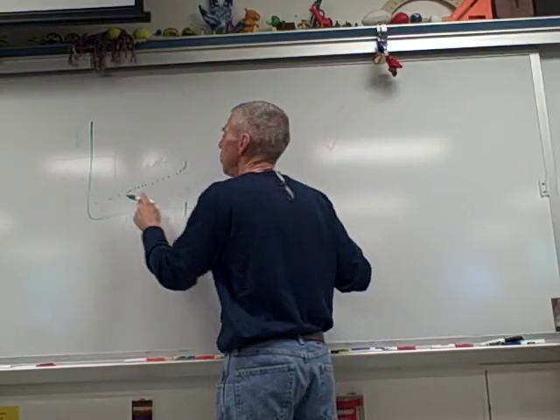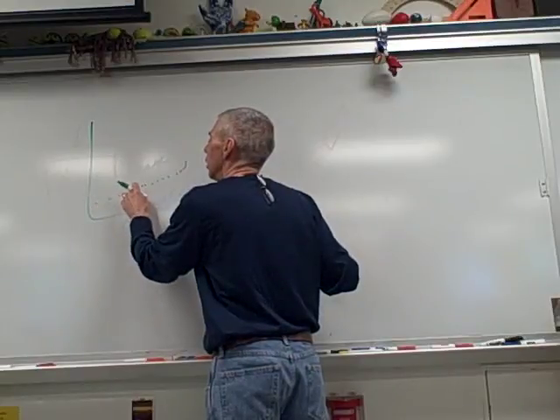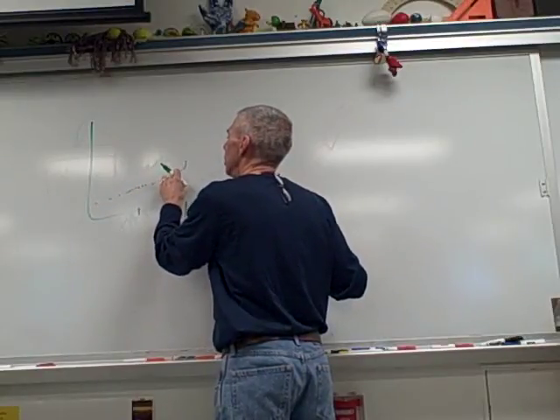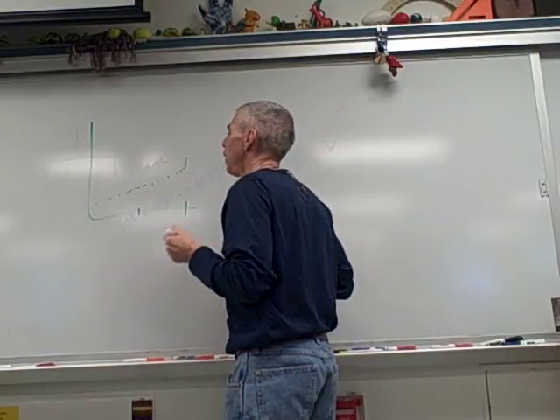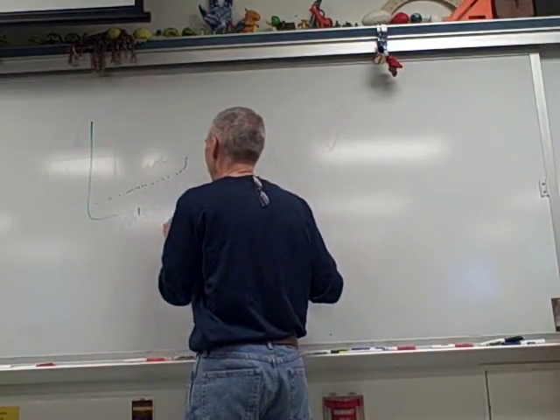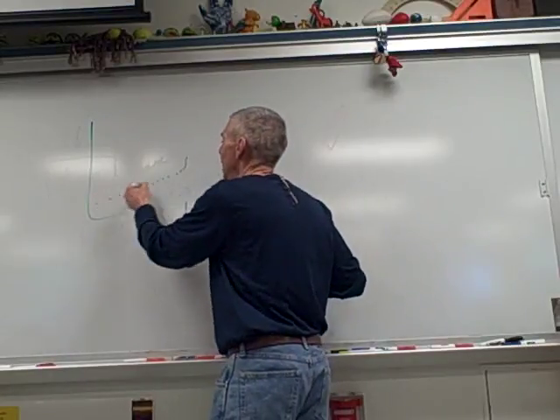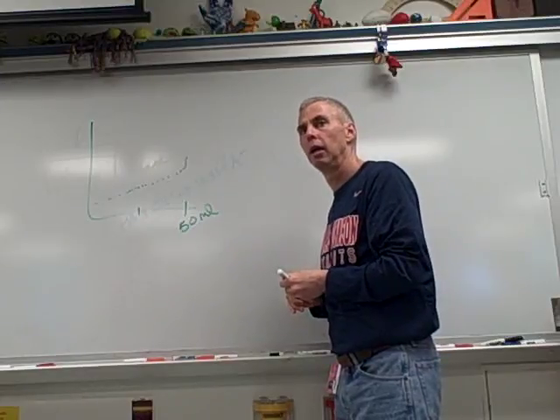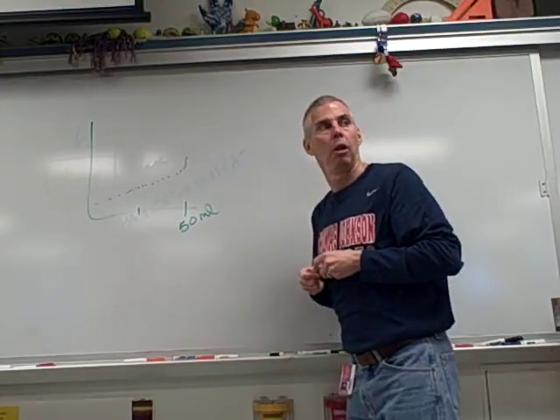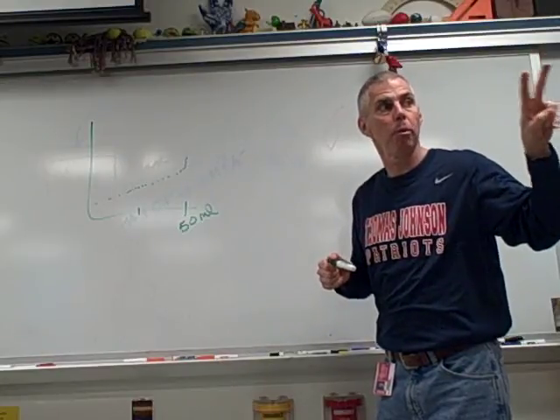By a bunch of points, I mean I'm adding a small amount of base here, a larger amount of base here, a small amount of base here, going up by only a few tenths. Because if I've got to add, say, 50 mils of base, and I go up by a tenth every time, I'll be there till next Tuesday. So you just want to do smaller intervals when you get close to the two important points.